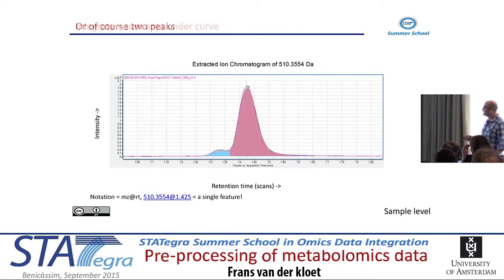But if I look closely, I can already see that I have 2 peaks here, which are not separated. This is already very difficult to automate, because in one sample this will look like 1 peak, and sometimes it's 2 peaks, separated or not separated. It looks really trivial, but the results can be very problematic from sample to sample.